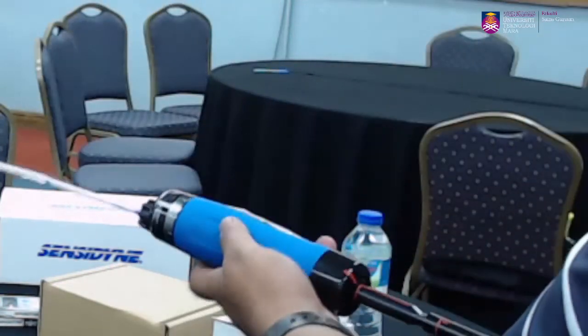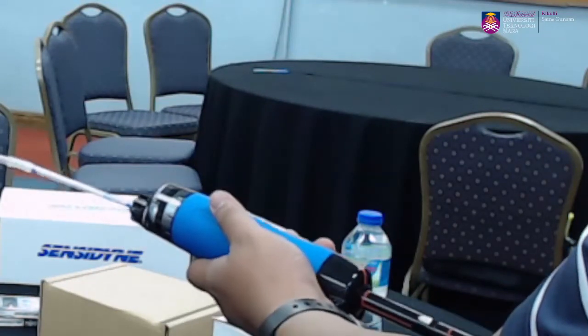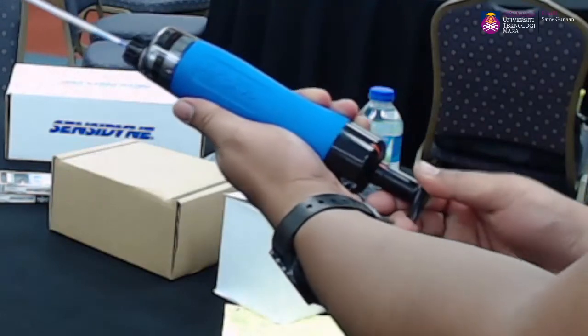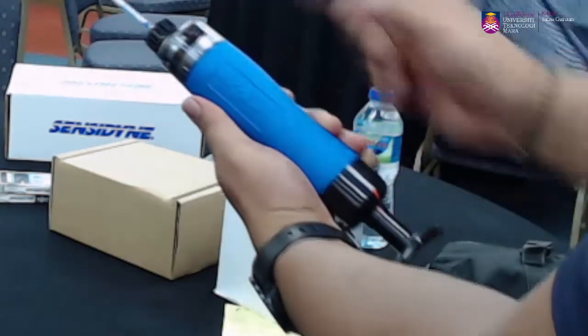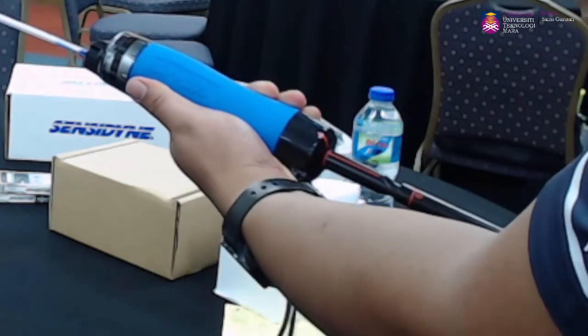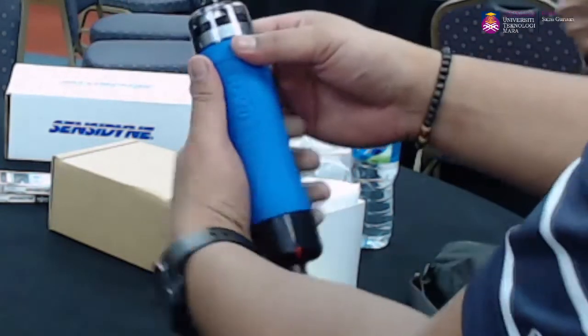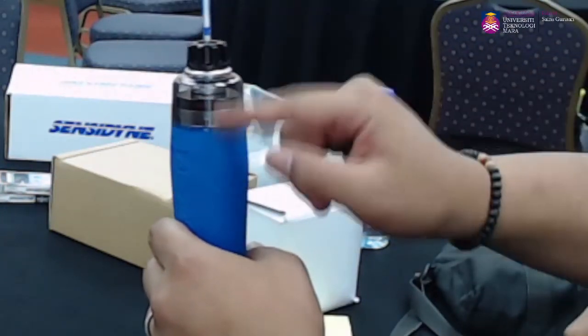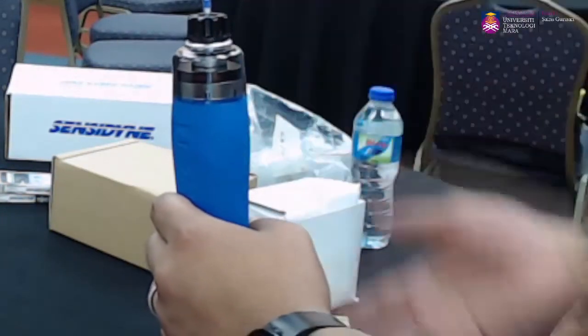Selesai, go for the third stroke. Kita turn. Kita tolak sampai habis. Pusing. Bukan tunggu dia ni. Dia dah keluar. Dia dah turun. Okay, kita just tarik. Okay, that's slow. So dia akan lock. So daripada situ indikator dia still akan masuk ke dalam. Daripada situ nanti dia akan keluar lah once dia dah habis sampling for the third stroke lah.